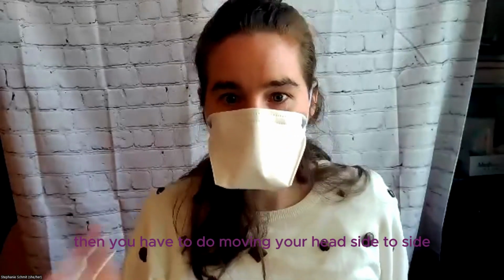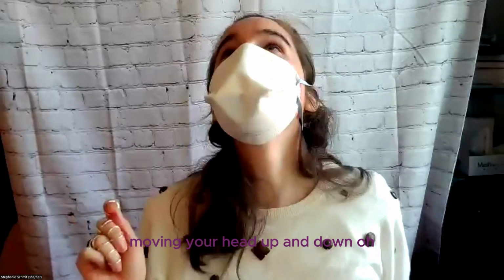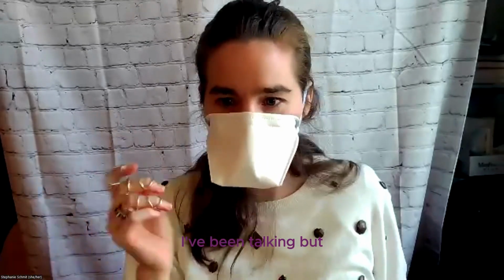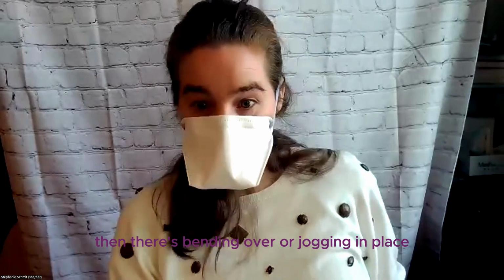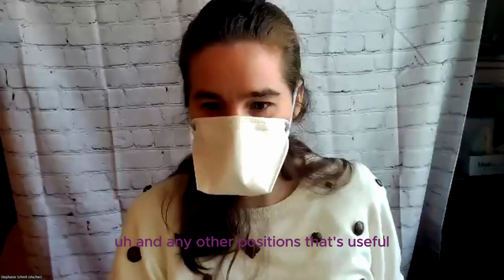Then you have to do moving your head side to side, moving your head up and down. Oh, I can tell that it unsealed. Talking, I've been talking, but you want to try to talk with your mouth slightly open so your tongue is still exposed. Then there's bending over or jogging in place. I don't do those things. And any other positions that's useful.